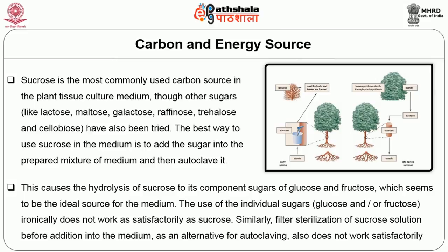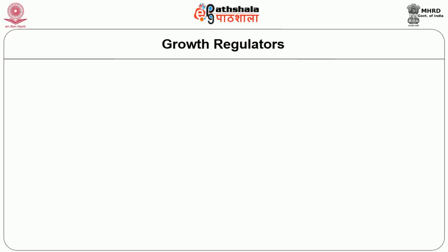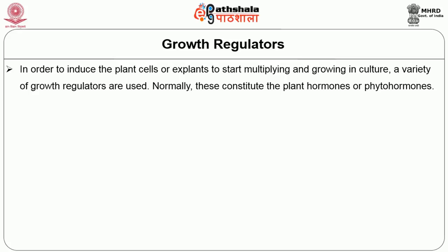The next component in the medium is the growth regulators. In order to induce the plant cells or explants to start multiplying and growing in culture, a variety of growth regulators are used.